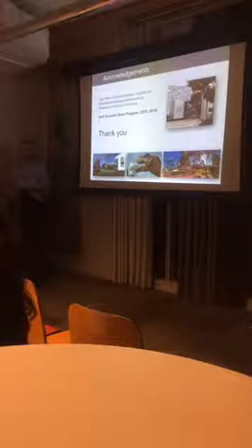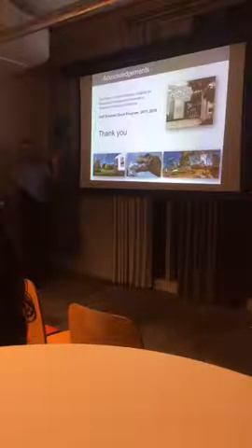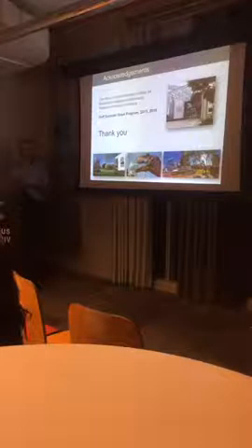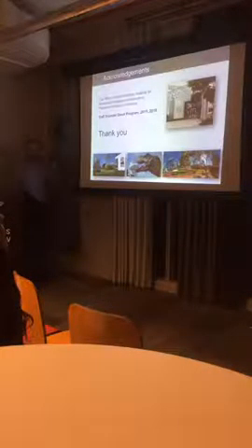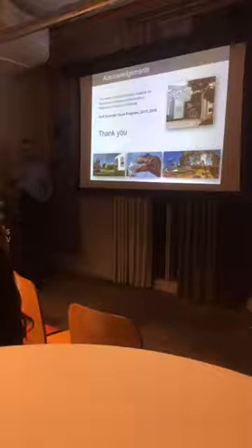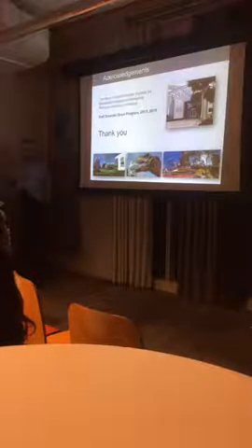Is there an importance to the camera's bit depth? Do you think that 8-bit is good enough? 8-bit is enough to get this image. But certainly, if you have a much faster camera, less noisy, the images could be much better. But for some scientific purposes it may be worth the price, while for the practical purposes of the microscopy, 8-bit is enough. We use 512 by 512 pixels, and 8 bit is enough, but 12 bit is better.